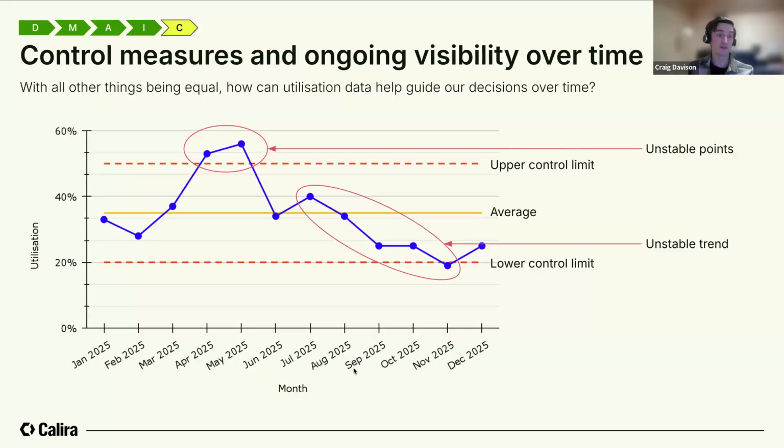Maybe you also want to explore daily trends. Maybe, previously with the flow cytometer, you discovered that Monday and Tuesday were actually quite quiet days, and the solutions you implemented were aimed to improve that. So that's what you want to track. Or maybe you're not tracking utilization. Maybe you're looking more at cancellation rates or failed runs or unexpected downtime. Whatever it is you determine to be important to your problems, that's what you want to track and have control limits for. And as I said, that might vary across your instrument fleet and across your different labs.